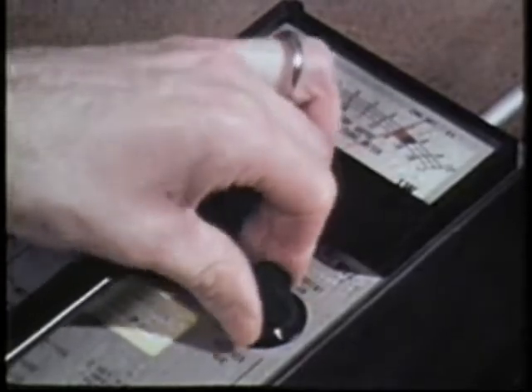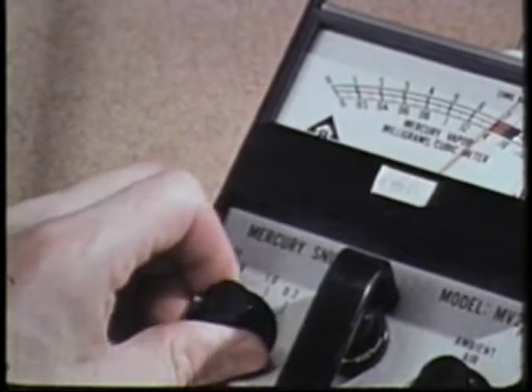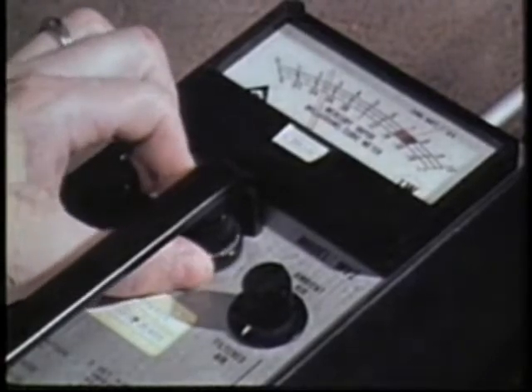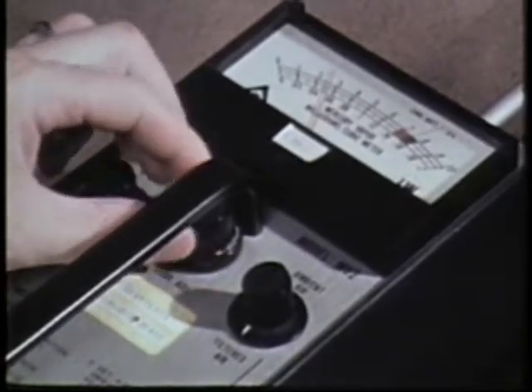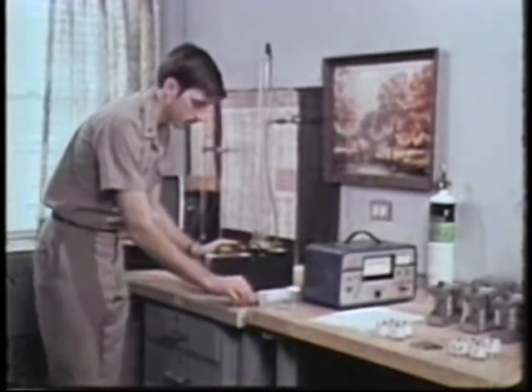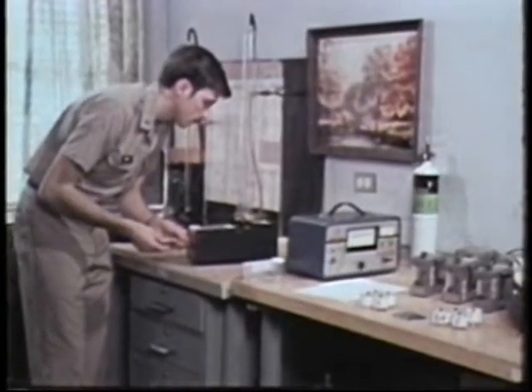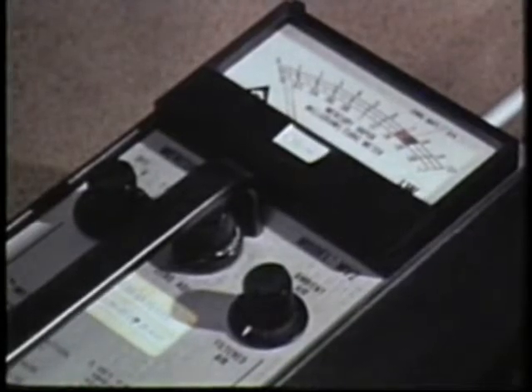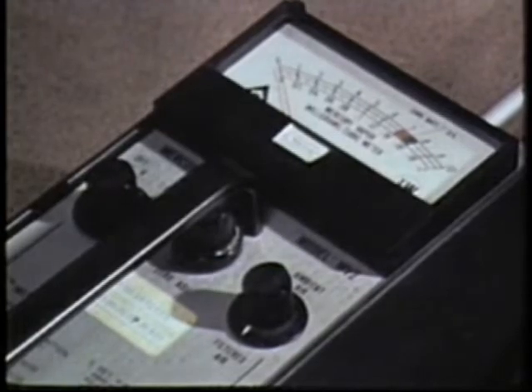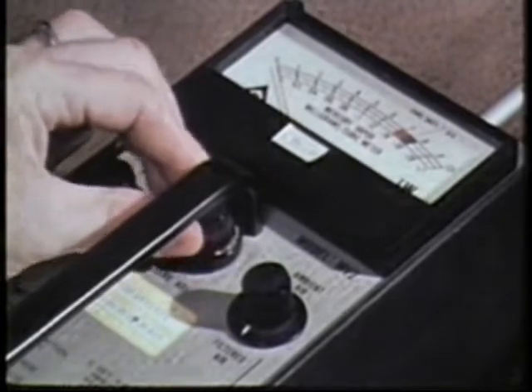Set the air control knob to the filtered air position and the function switch to 1.0. Now loosen the locking clutch on the zero adjust knob and turn the knob as required. If you're unable to zero the meter that way, larger corrections can be made with the coarse adjust screw. Use the zero adjust knob for the fine adjustment.